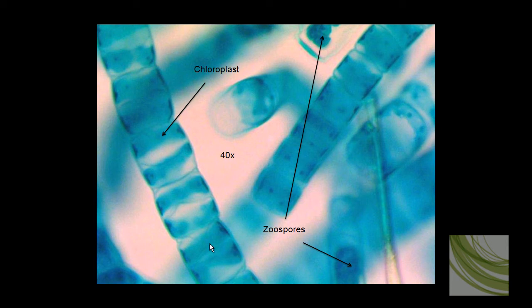And here is eulethrics using the 40x objective. We can see these square-like segments, and this green structure would be your chloroplasts. We can see some kind of fuzzy zoospore areas mixed in here.